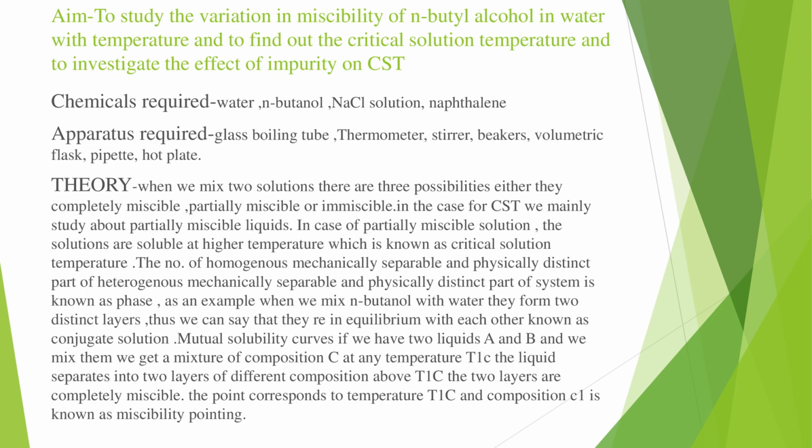Diving straight into the experiment, our aim is to study the variation in miscibility of N-butyl alcohol in water with temperature, to find out the critical solution temperature, and to investigate the effect of impurity on critical solution temperature. The materials required are a glass boiling tube, thermometer, stirrer, beaker, volumetric flask, pipette, and hot plate. The chemicals required are water, N-butanol, NaCl solution, and naphthalene.